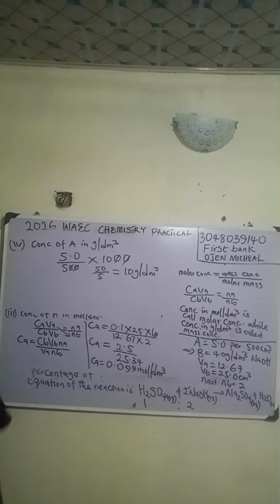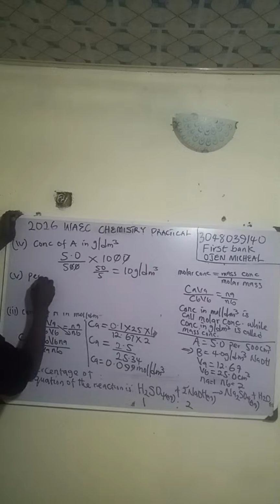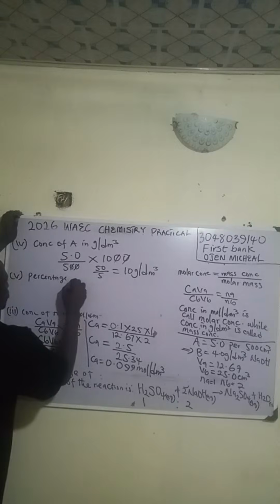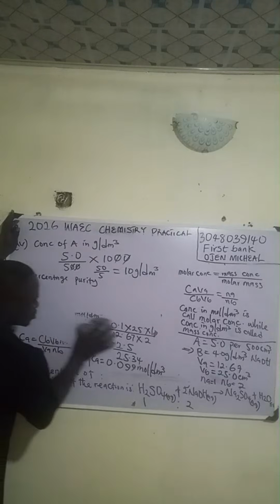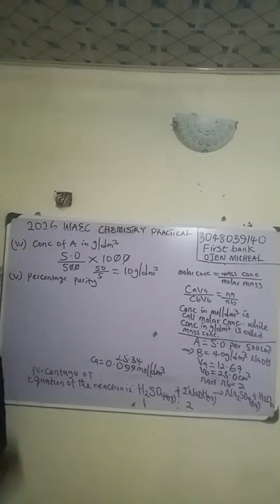The next question is percentage purity. Beautiful.